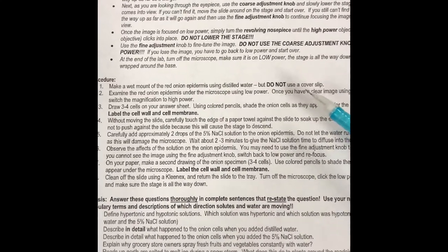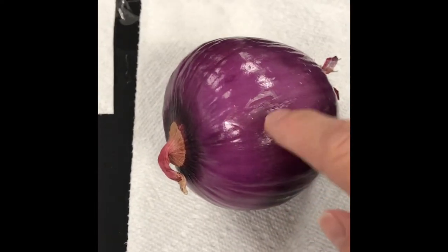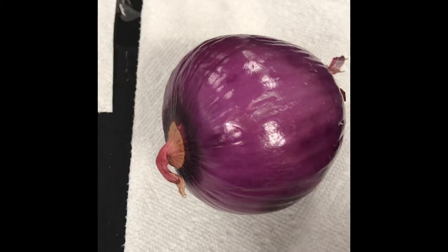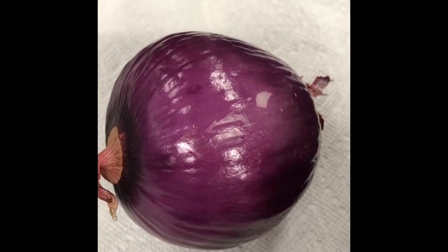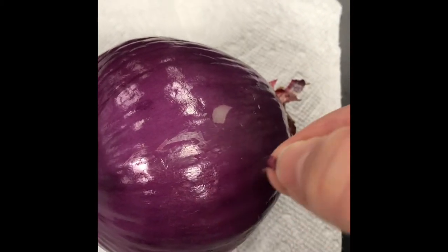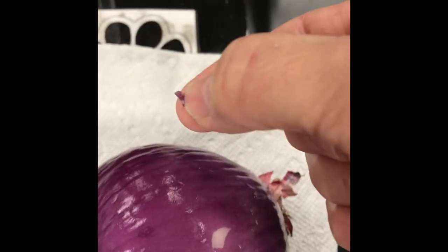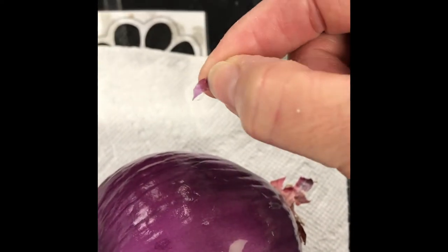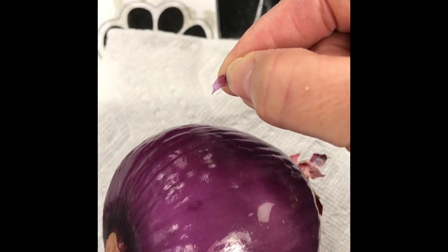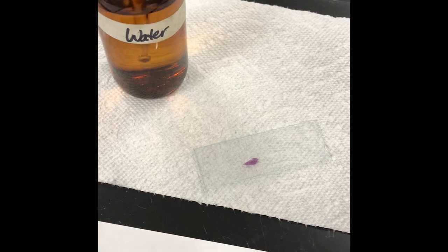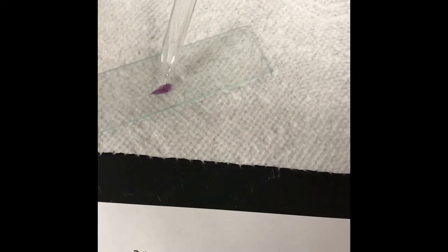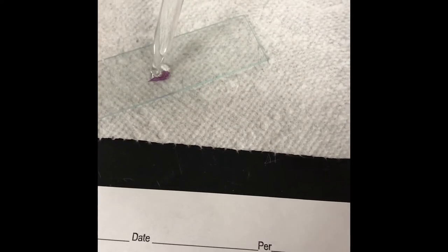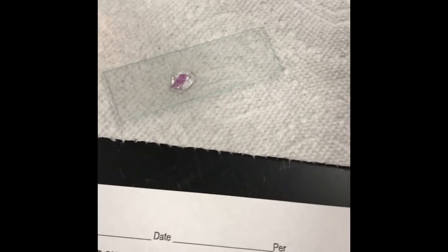I'm going to make the wet mount. First, I'll take the red onion, and this time I want a piece of the outside because I want it to be red. Do you see this piece right here? I have a little piece of the epidermis in my hand. I'm going to put that on my slide and add a couple of drops of distilled water to the epidermis. It's floating a little bit, so I may want to push it down.